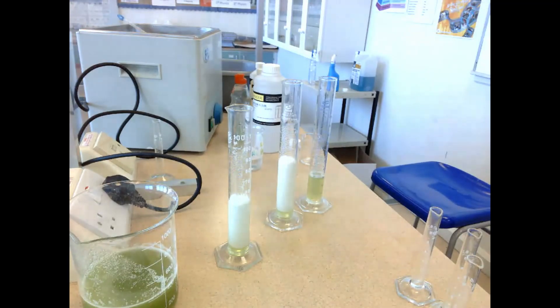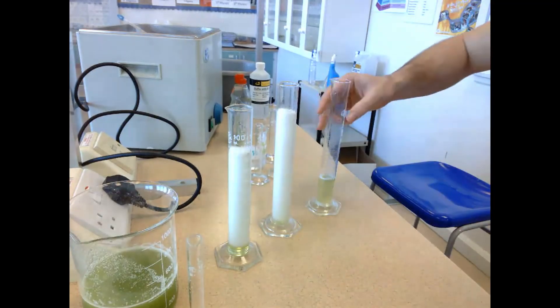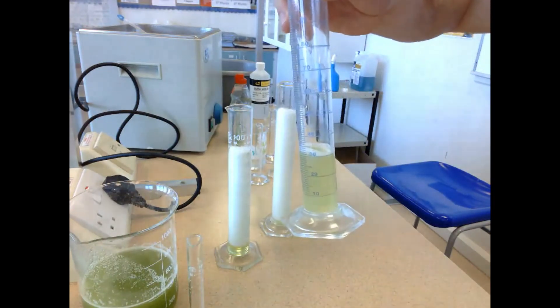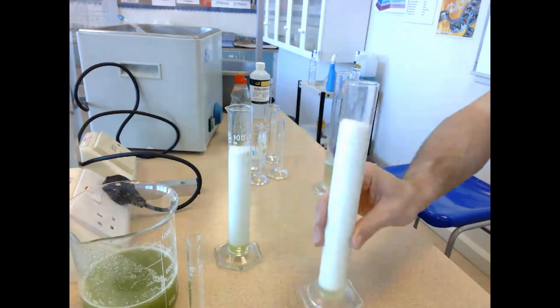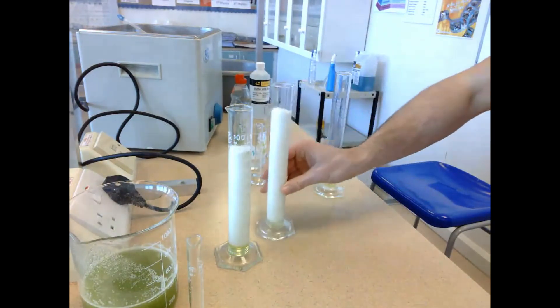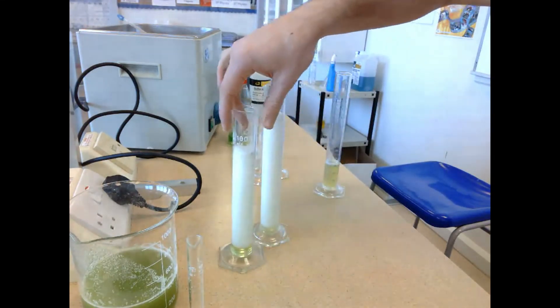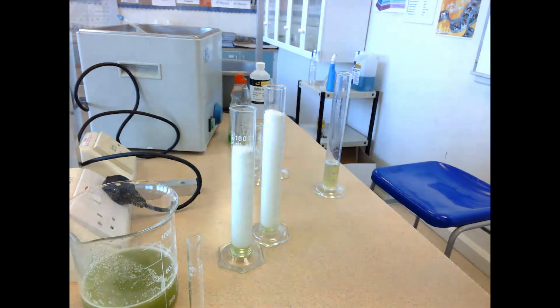pH buffer 3 — there is nothing really going on. pH buffer 9 — it's a rapid production. pH buffer 12 isn't that far behind. So what we can say is catalase works best at pH 9, but it still has a good rate of activity around pH 12. It has very little activity at pH 3 — it has more than likely been denatured and therefore cannot work because it's lost its shape and its ability to function. pH buffer 9 did end up having the greatest volume of foam produced, which suggests that pH 9 is the optimum for catalase activity.